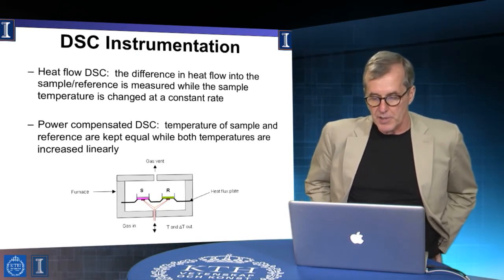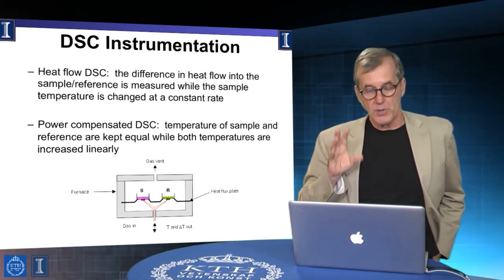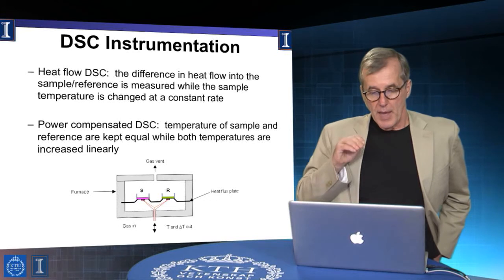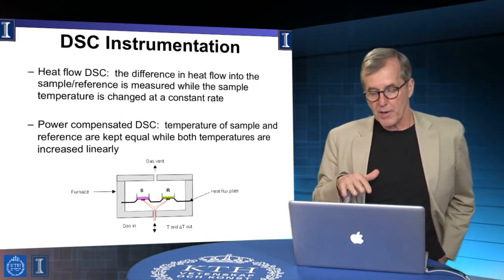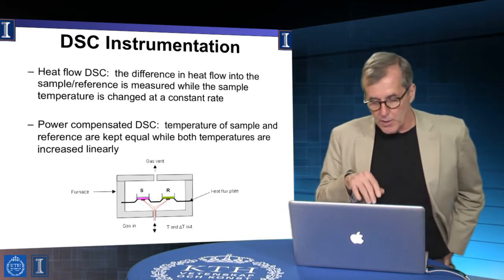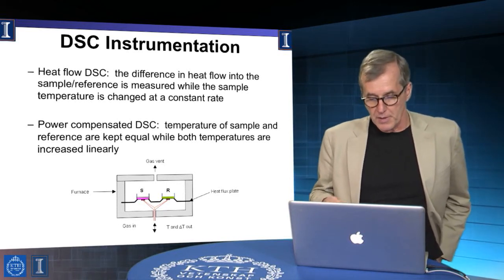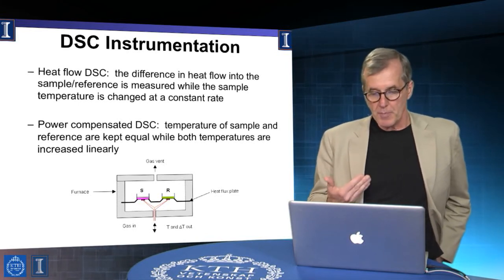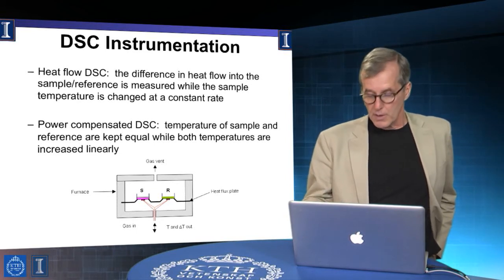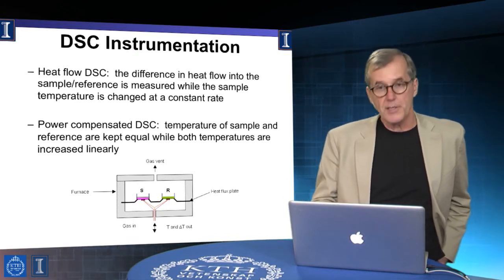Basically the instruments are designed to let us maintain both the sample and reference, and to control the temperature in the background, such that the temperature in the sample and reference is maintained at constant temperature, one relative to the other, as a differential temperature ramp profile is being initiated, but to do so in a way that we can actually measure the change of the energy flux into each of the two components, right? So basically, this will allow you to say something about the fundamental quantitative attributes of the kinds of transformations that we saw evidenced in differential thermal analysis.